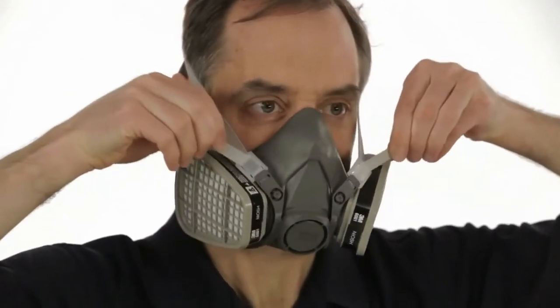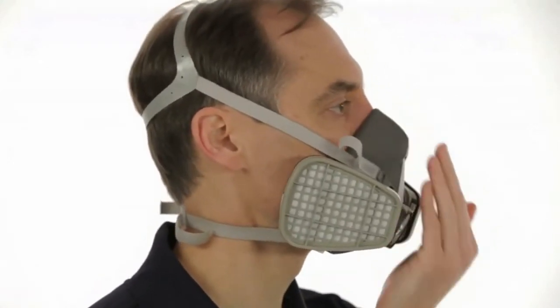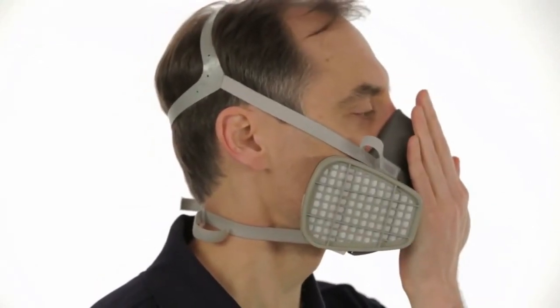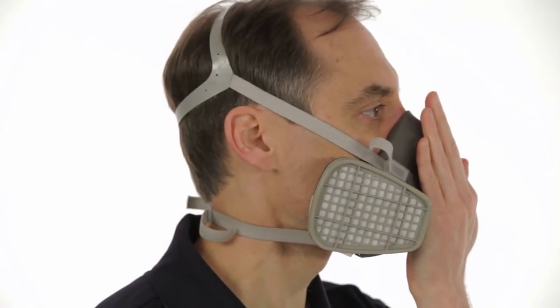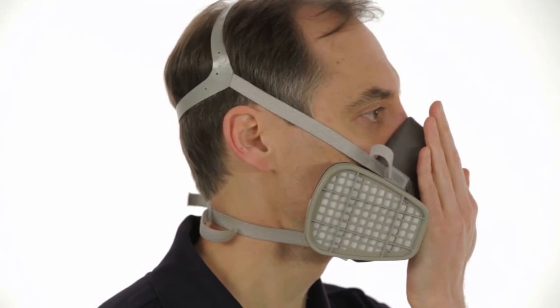Before you enter any contaminated area, you must perform either a positive or negative pressure user seal check. To perform a positive pressure user seal check, place the palm of your hand gently over the exhalation valve cover, being careful not to apply too much pressure and disturb the face seal. Exhale gently. If the facepiece bulges slightly and you feel no air leaking between your face and the face seal, your respirator has sealed properly to your face.